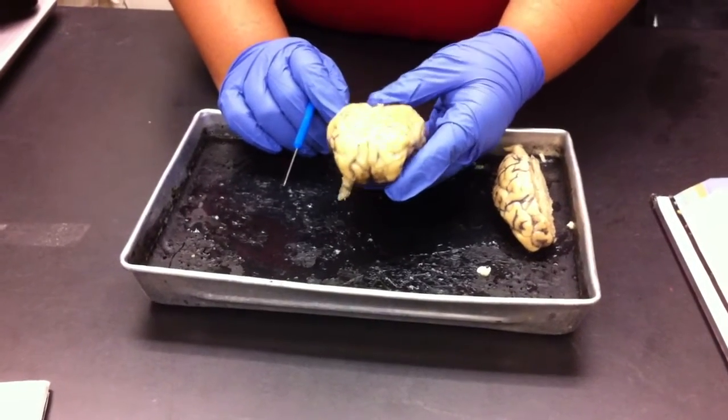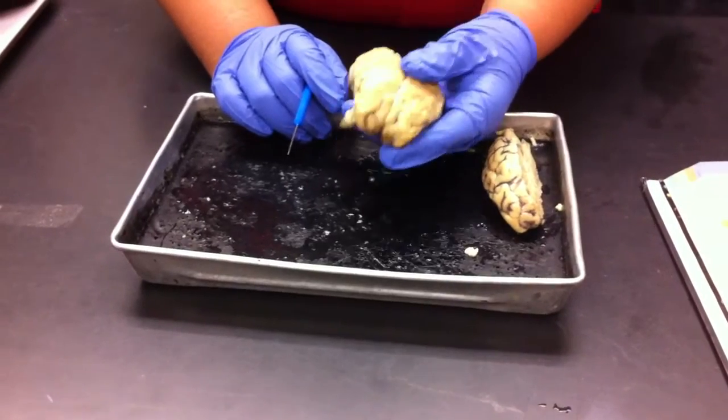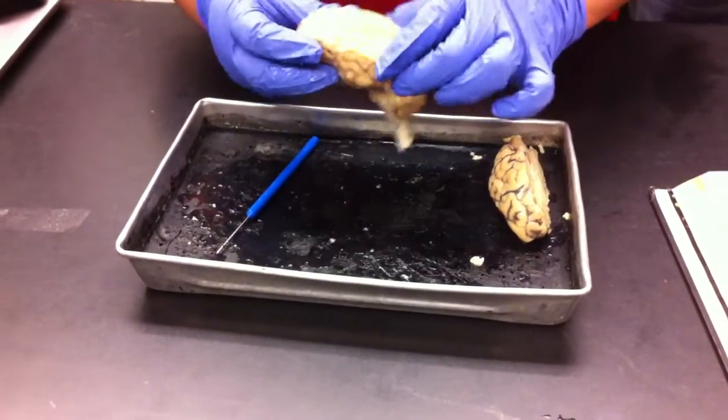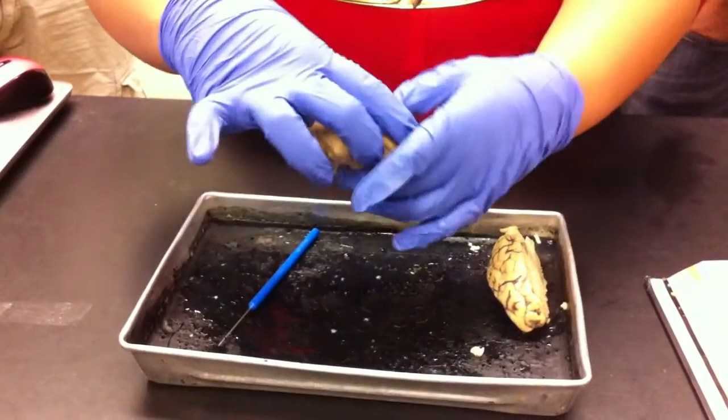So right now we're going to do the sheep's brain presentation. I'm going to start off with the whole brain so you have the general anatomy of it. First off, we have the cerebrum. It's not nice and round like ours, it's more ovalish. And then we have the cerebellum down here.